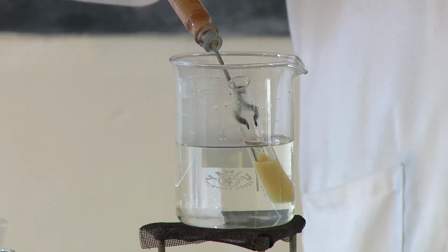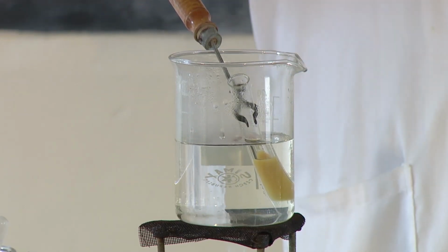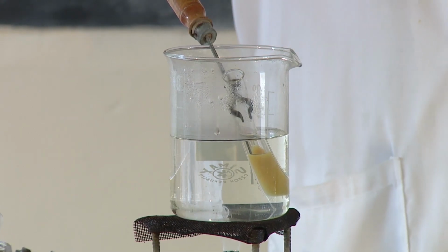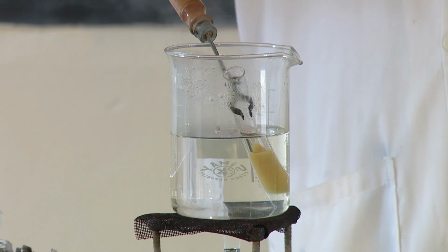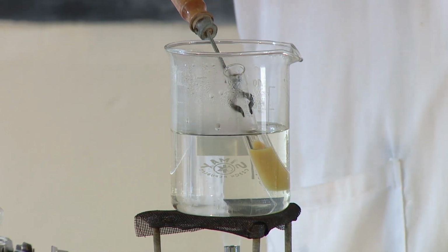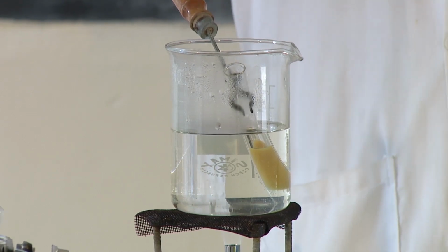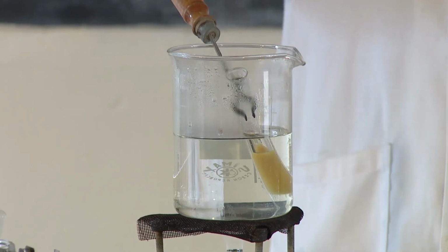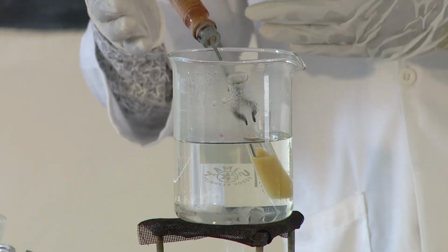Why do you have to add hydrochloric acid, students? We add hydrochloric acid to hydrolyze the bonds, because I told you the sucrose is unable to reduce copper ions. So we have to add hydrochloric acid in order to hydrolyze the bonds. Then from there, we add sodium hydroxide to neutralize the acid.